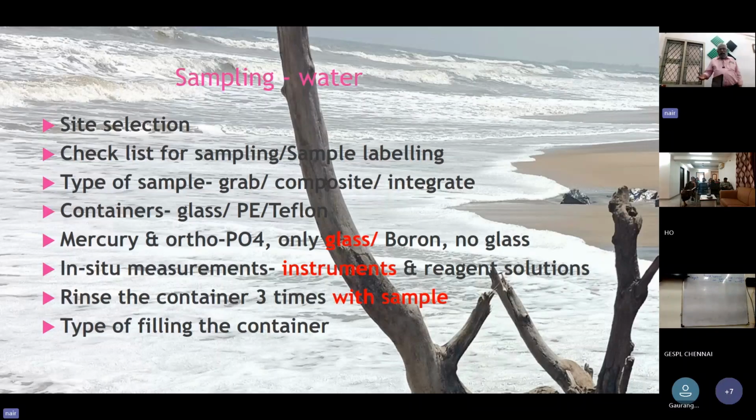If it is river water, you take the water, wash it, and clean it, and you repeat it 3 times. Even if the can may have some water in it, you have used it, washed it. If you rinse it 3 times with the sample you are going to collect, it will ensure that the container will give you a representative sample and no dilution or chemical reaction happens.